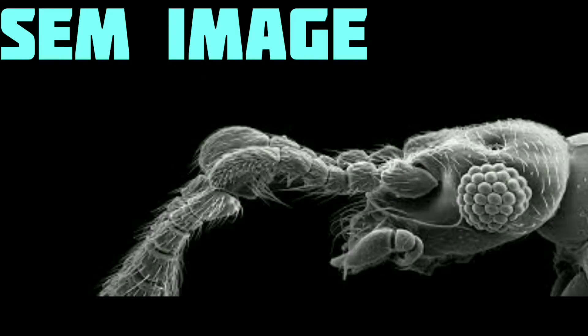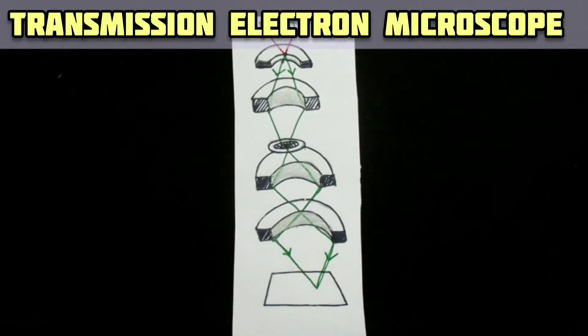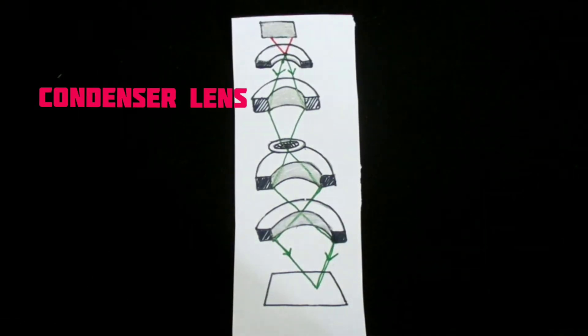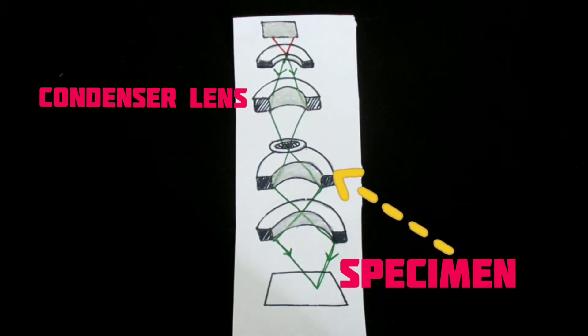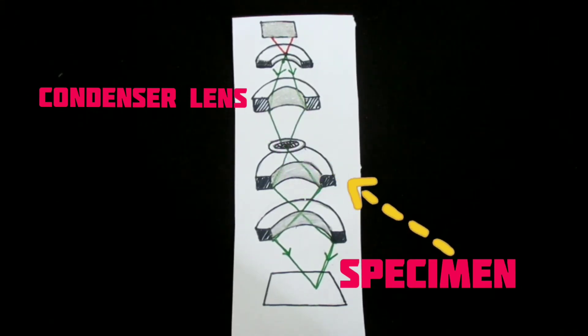In case of transmission electron microscope, a condenser lens focuses the electron beam onto the specimen and electrons are transmitted through the specimen. The portion of the beam absorbed by the specimen is minimal.